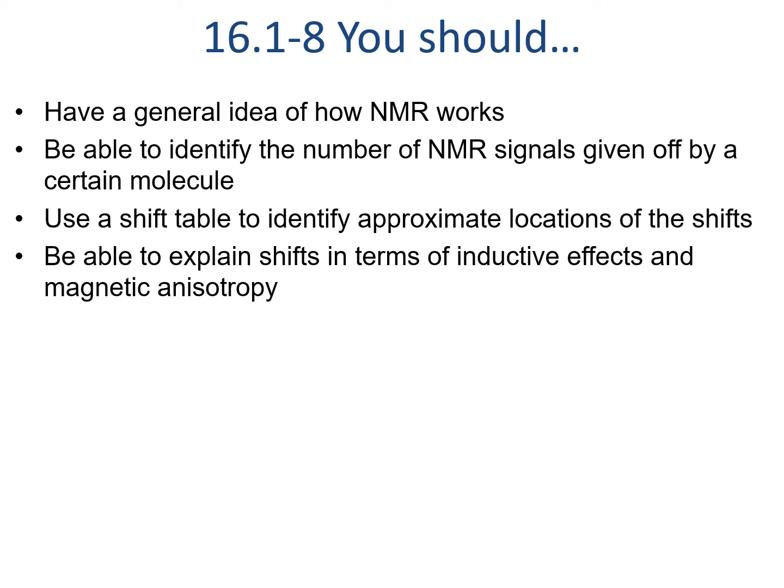In our last lesson, we gave a general overview of NMR, focusing largely on how to identify how many signals a molecule should give, and also what locations those signals will show up. In this lesson, we'll focus on how to tell how many protons a signal represents, and also how to use NMR spectra to give information about neighboring nuclei, other hydrogens nearby. We'll also talk about carbon-13 spectrum.